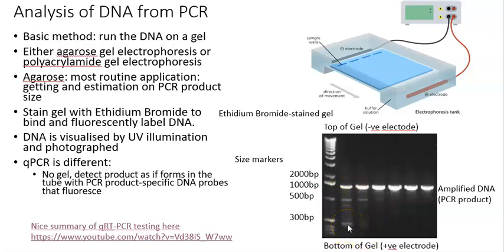We sometimes get that in PCR. This is a sign of a non-optimal reaction here. I'm not going to go into any great detail about why we've got the extra bands, but I was optimizing a PCR, trying to make it work perfectly. It works perfectly there. It doesn't work perfectly there. So that is how basic PCR works.